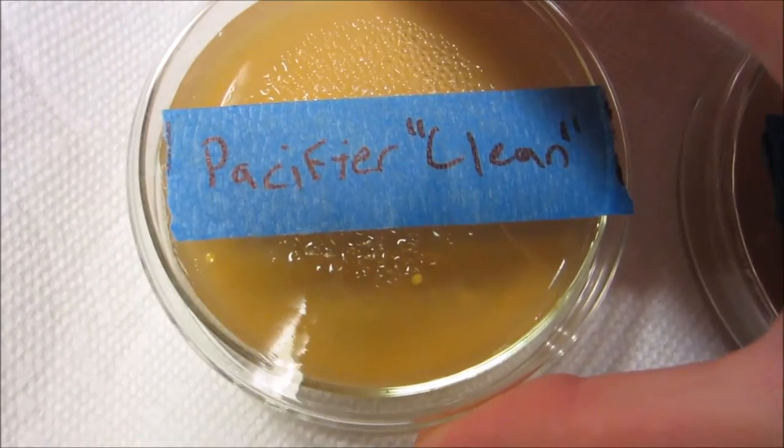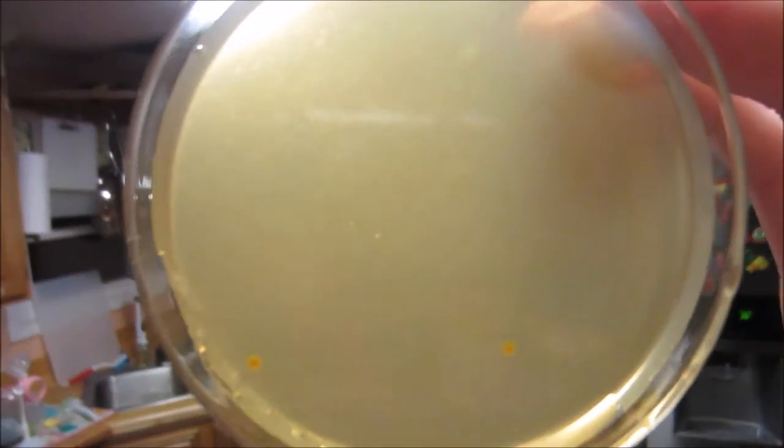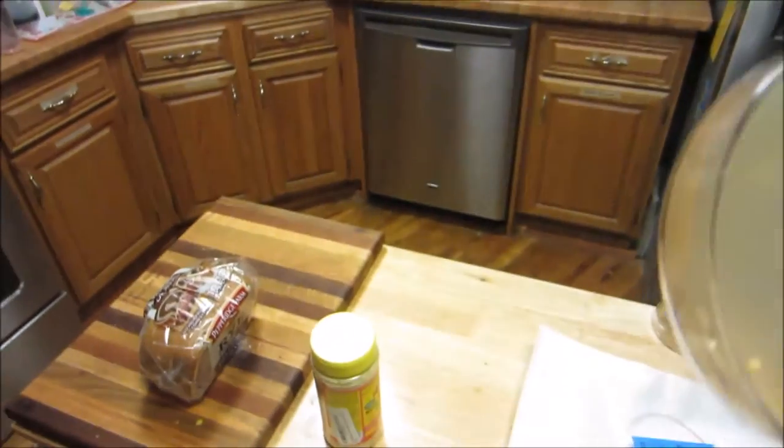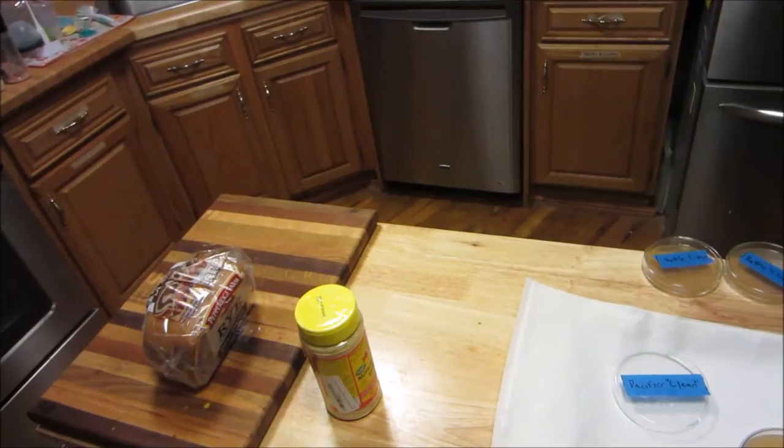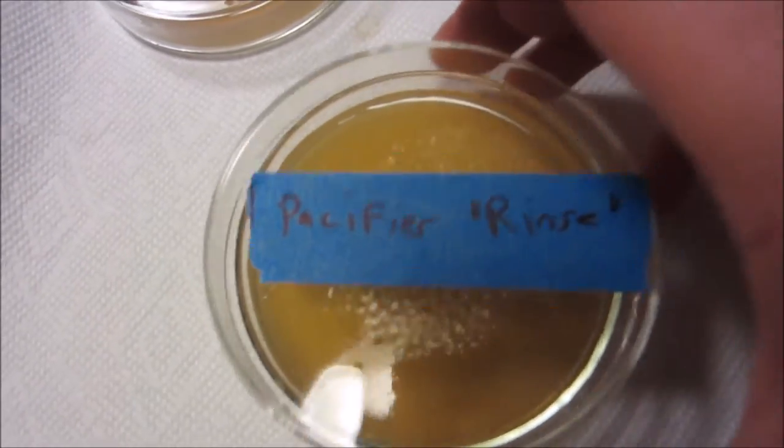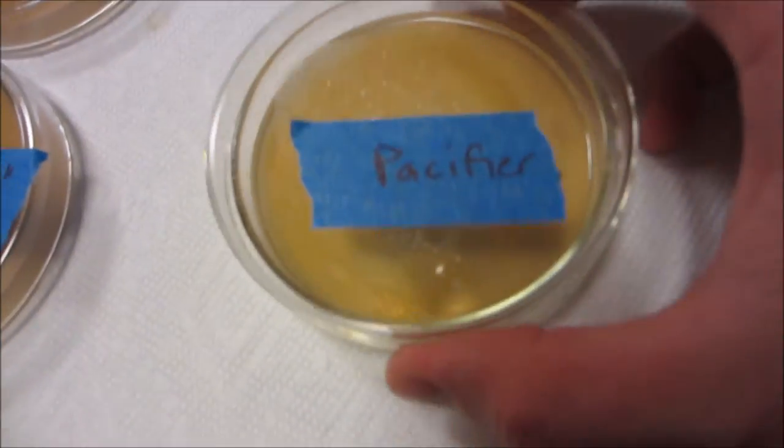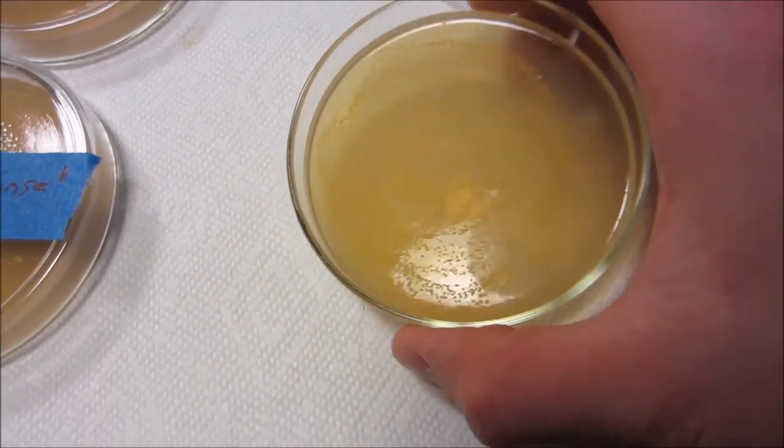On the clean pacifier, you can see that there's actually a couple, so even with soap and water, it wasn't quite enough to clean it entirely. Next is a rinsed pacifier, which you can see has a lot of growth on it. And finally, I have a used pacifier, straight from the baby's mouth. You can see there is a huge amount of growth on it.